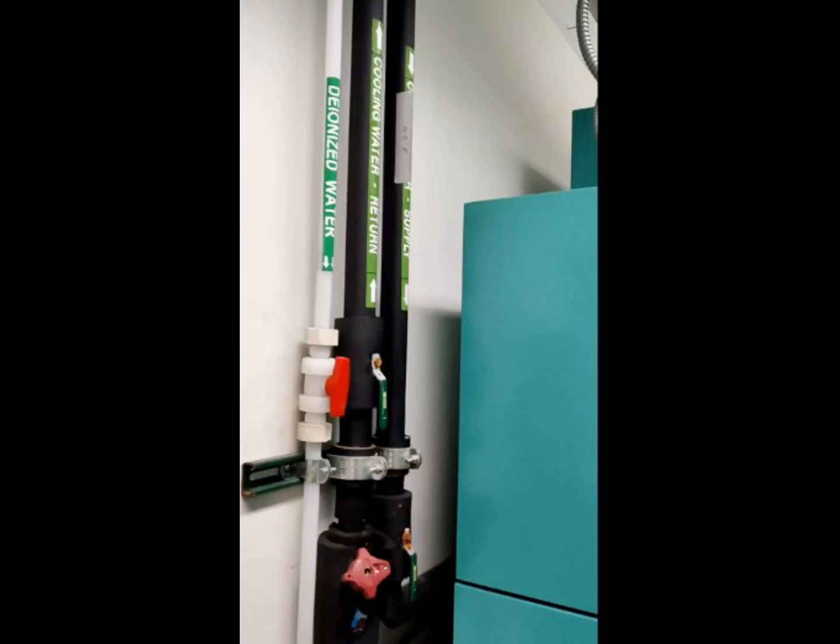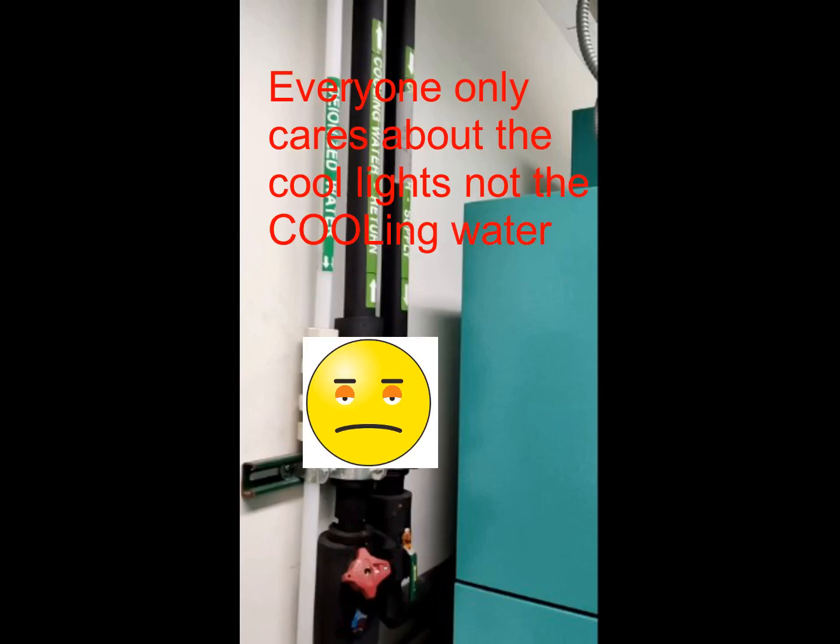It is super important to keep the environment in the chamber tightly regulated for the plants to grow as planned, and the cooling water is the main regulator for all of this. So the cooling water deserves a round of applause, and it's totally slept on because it gets no love.